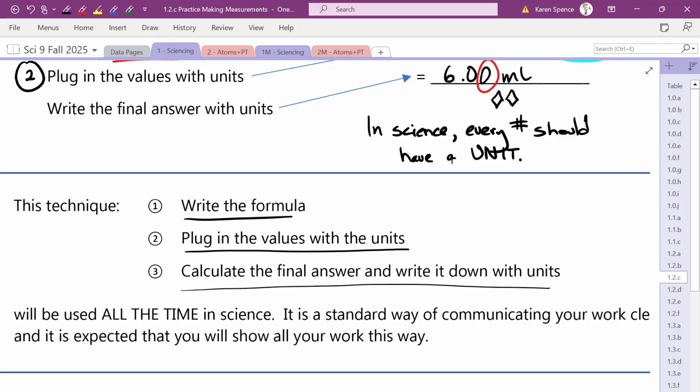Matthew, remember you can always just bring the burette out of the clamp and bring it down to you. Not recommended, okay?